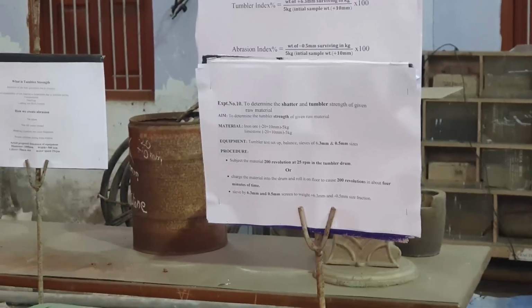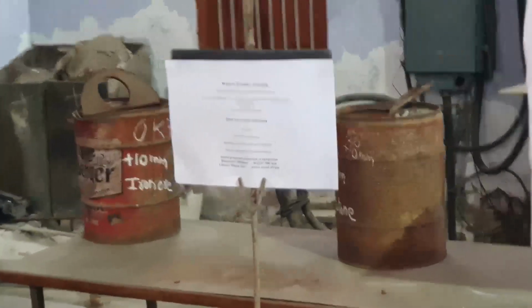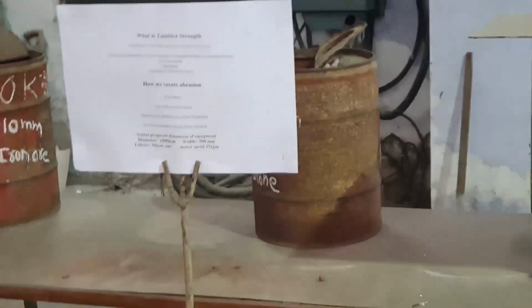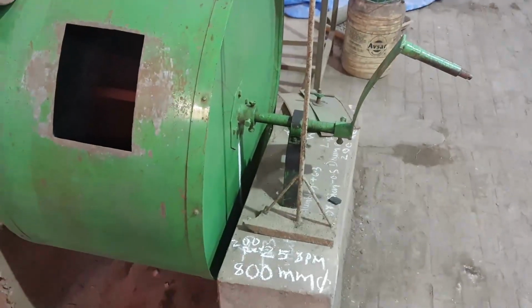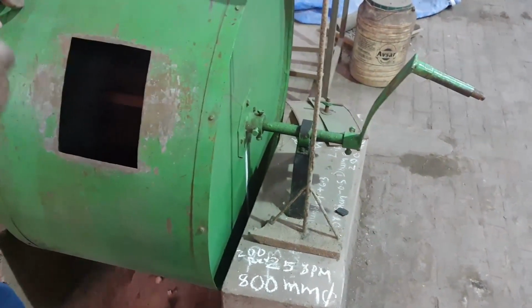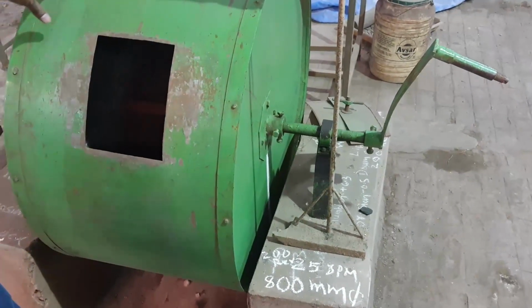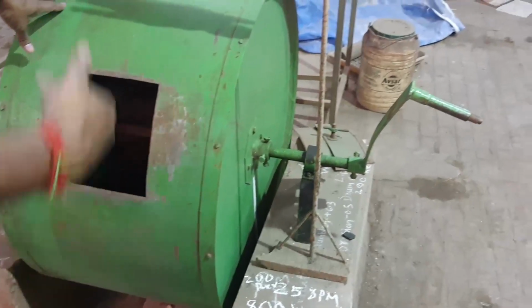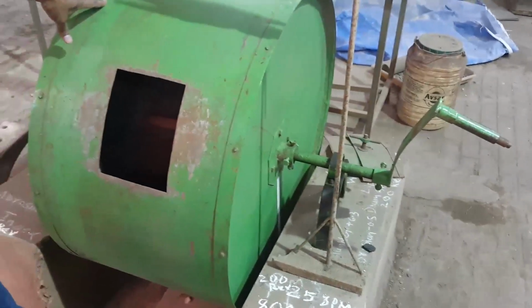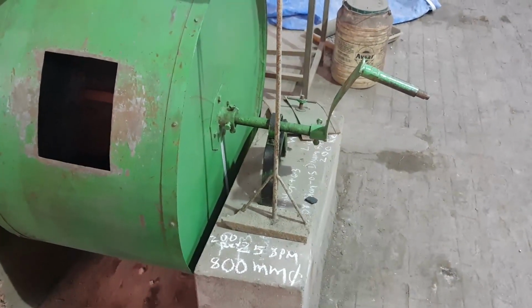So this is the drum, but what do we have to maintain? How many revolutions? 200 revolutions, and 25 rpm speed is required. If the motor is set up along with this drum, then it will maintain that 25 rpm, and here we are rotating 200 revolutions with the same 25 rpm.